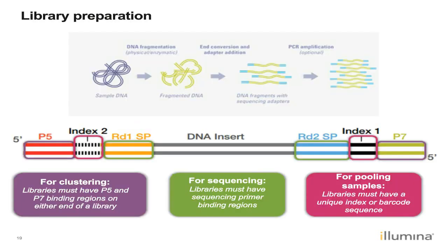So now that we've selected the library preparation method we'd like to use, let's take a look at an overview of library preparation steps. Depending on the type of library we're preparing, some of these steps may be a little bit different. In this example, we are preparing a whole genome library. We will start with our nucleic acid. In this case, it's DNA.